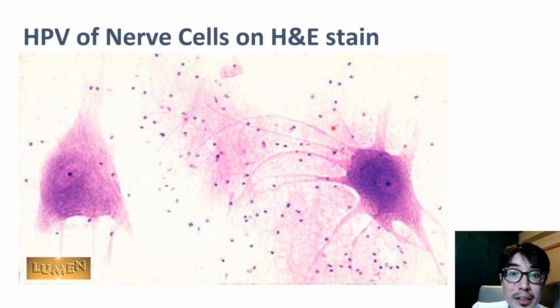Nerve cells are typically stellate or star-shaped with several cytoplasmic extensions or processes. Here again, we note that the cytoplasm of these cells contains dark basophilic material, and in electron micrographs, this material will turn out to be abundant rough endoplasmic reticulum, which is associated with protein production.